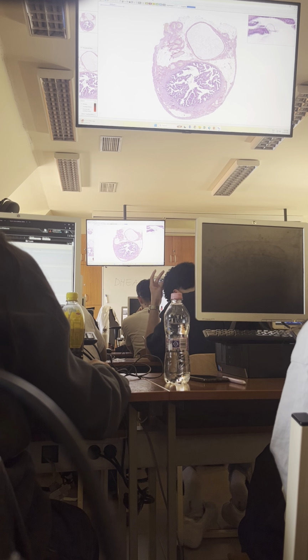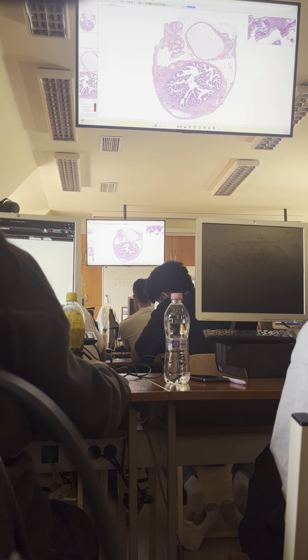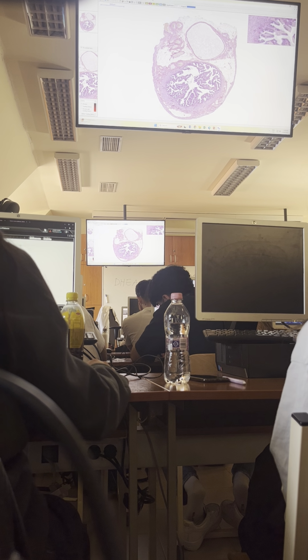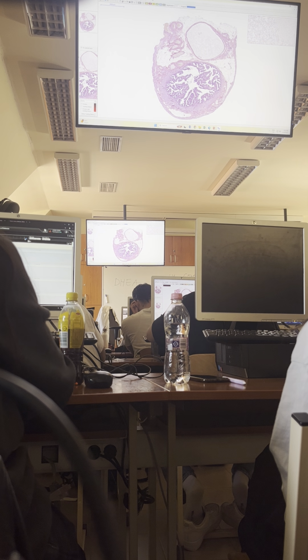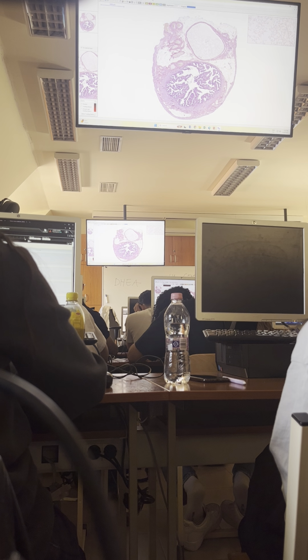Okay. So first of all, we can see two big lumens here. This is one of them, which is very labyrinthic. Actually, this is the cross-sectional profile of the uterine tube. This other similar size but much more regular lumen has nothing to do with the uterine tube. This is an embryological remnant. Let's start with this uterine tube.